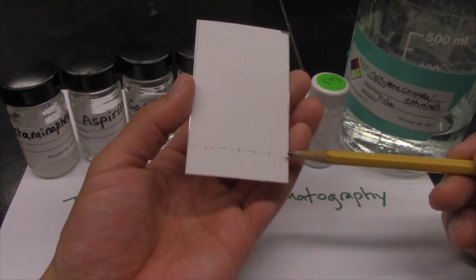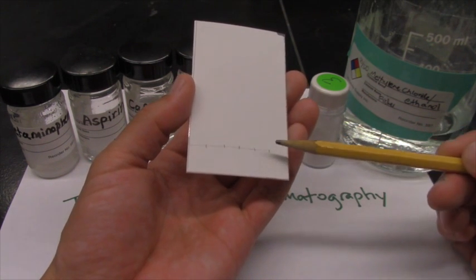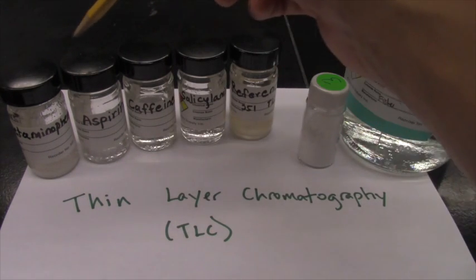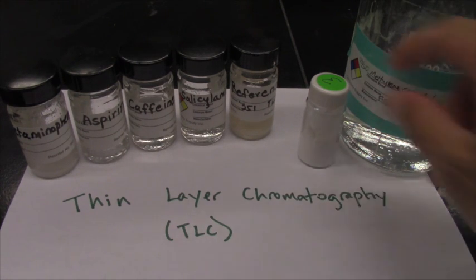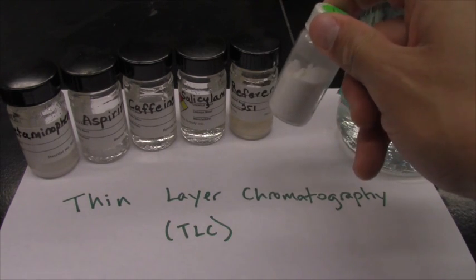You can see that I've marked 5 different spots on the TLC plate. That's where I'm going to put the compounds down. The different compounds that we're going to be using: acetaminophen, aspirin, caffeine, salicylamide, and a reference. The reference is going to contain all 4 of those compounds. I've also got an unknown. My unknown that I'm using here is unknown number 3.